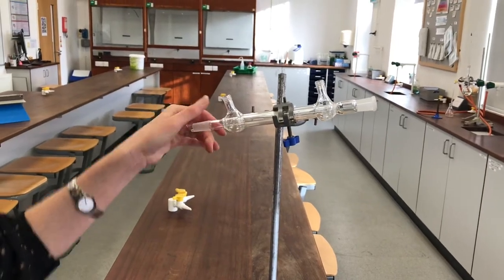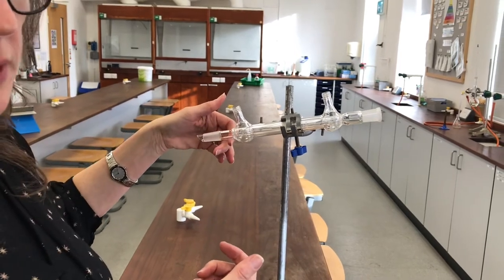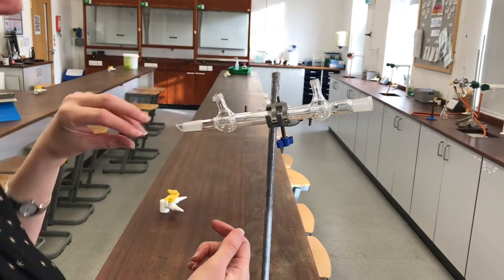Okay, so I want to show you how a condenser works because they're quite difficult to understand I think until you've actually handled one and had a really good look at it. I've got it clamped in here in a strange orientation because I want to show you something.